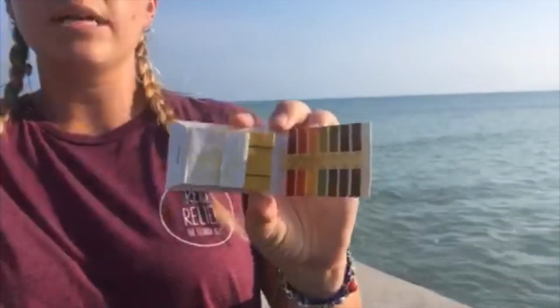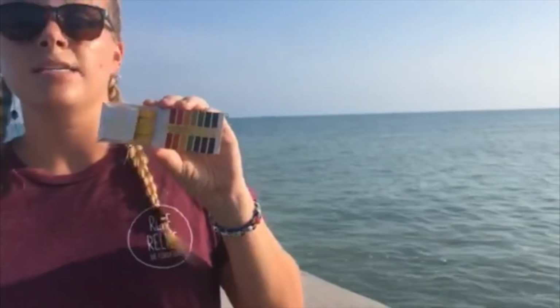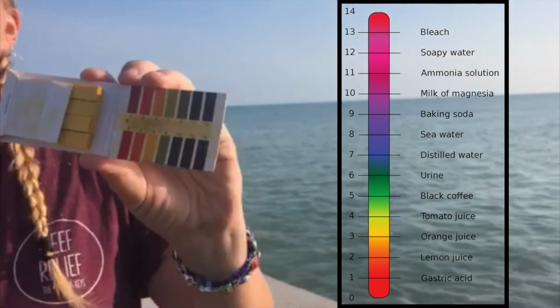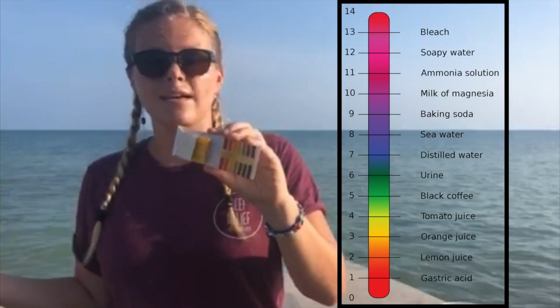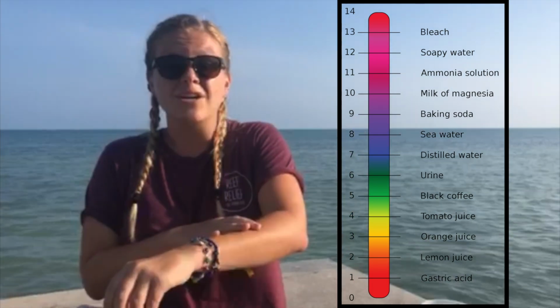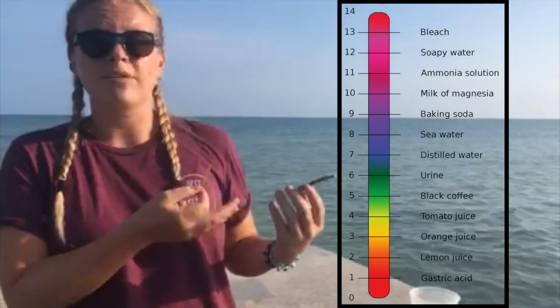So all you do is take one of these little testing strips, dunk it into our test sample, and see which color it lines up with on our pH scale. Again, from earlier today, if you remember, the colors that are like 1, 2, 3 are on our pH scale and are very acidic. So think lemons and vinegar and battery acid, all those things that would make your skin burn or seem like they would hurt your body, and would also hurt our coral reef.